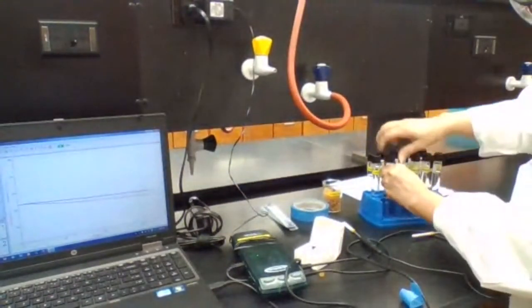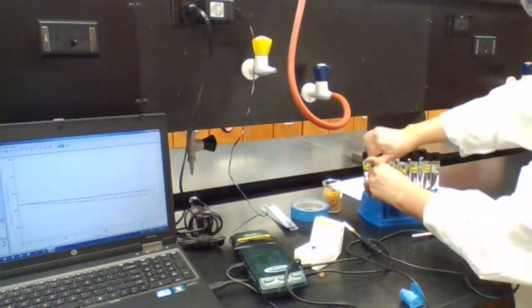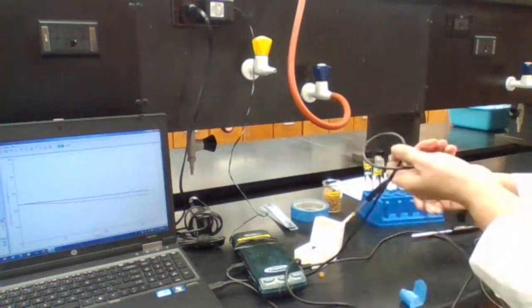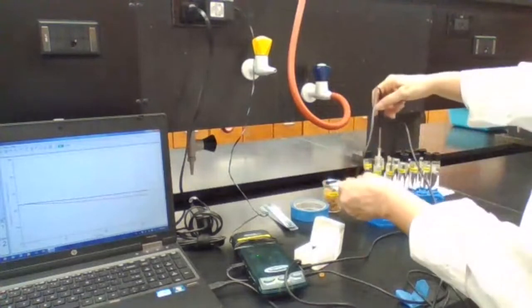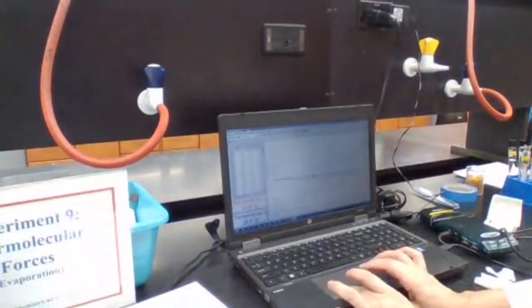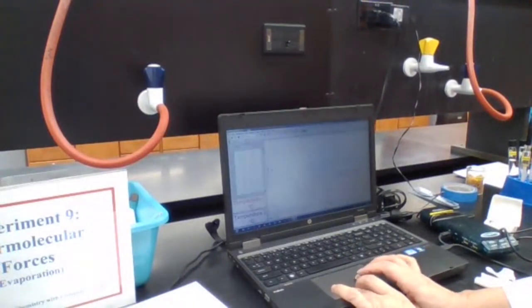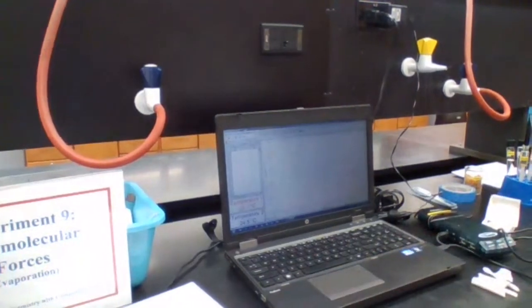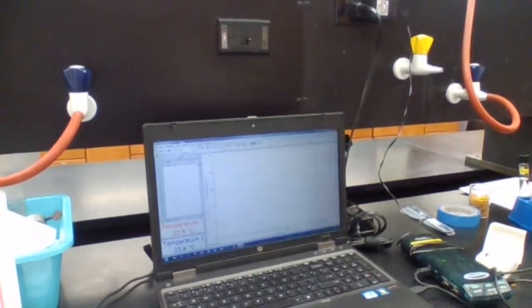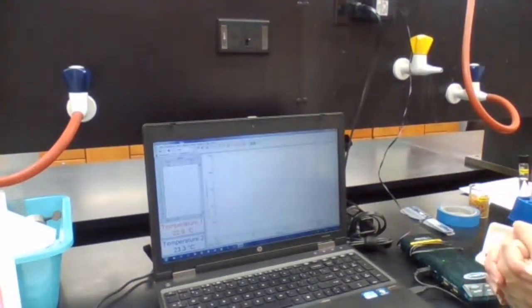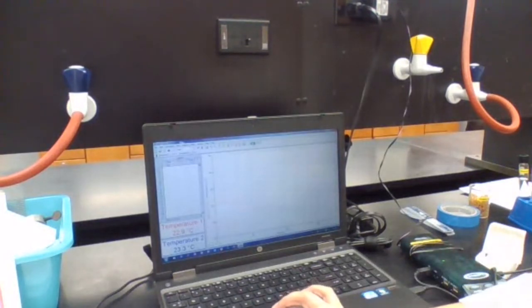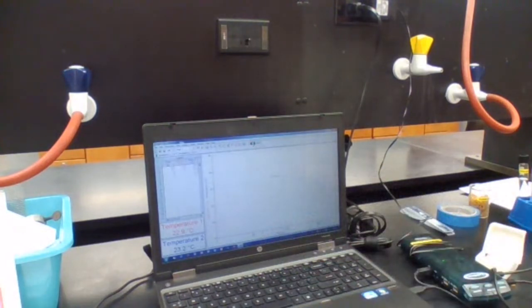I'm going to place it in the solution again, in the sample. Pentane and hexane. Channel one, which is this one, is going to go to pentane, shows with the red color. Channel two, with the green color, is going to hexane. Start new. Wait for like 45 seconds. We have the numbers: 22.9 and 23.3. Going to start with the collection first, then we take the two out.